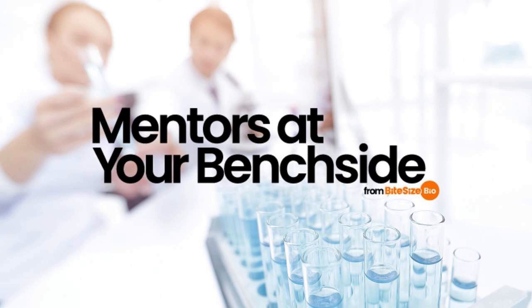Structural DNA analysis. Similarly, enough is known about DNA structure in relation to certain short sequences of base pairs that you can use Maxam Gilbert sequencing to obtain such granular sequence information that you can begin to make structural inferences about the DNA. Not bad, eh? So that's it for Maxam Gilbert sequencing and its applications.